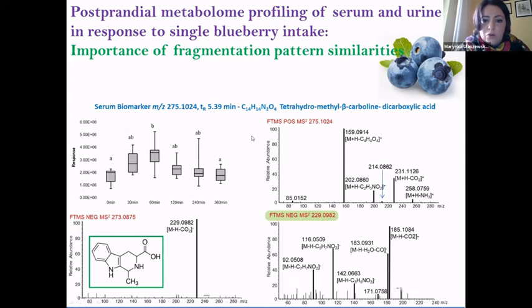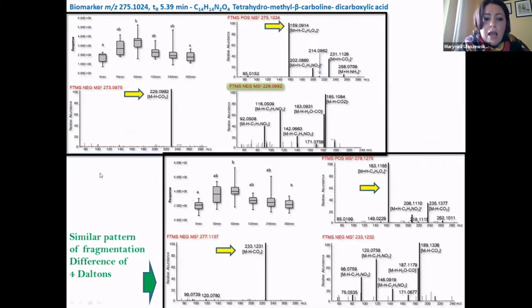That was the easy one because we had the analytical standards to be compared, but I found also another compound that was behaving very similarly, and the fragmentation pattern was also similar. Also, the numbers are not really the same, but you must know that the point here was to figure out the delta of 4 daltons, the differences of 4 daltons between the precursor ions, but also between all the fragments. And that was the main point where I found out that those compounds are correlated, and the only difference was the presence of the 2 double bonds.